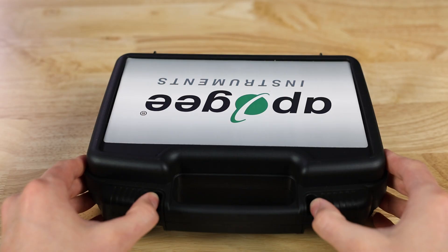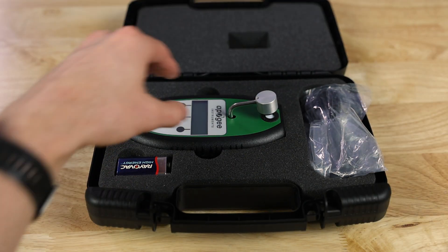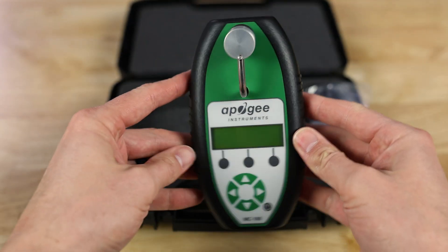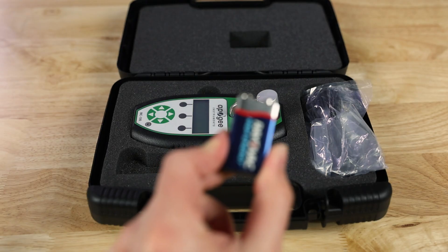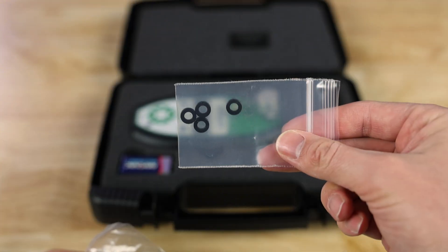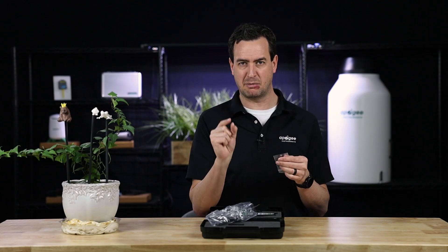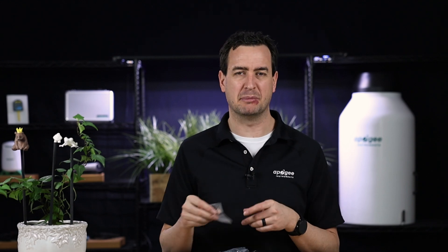Let's take a brand new meter and I'll show you what's inside the box. As we open it, we have the chlorophyll concentration meter, a nine-volt battery, a USB cable, and some sensor area reducers. These sensor reducers come in really handy if you're trying to measure a leaf that's really small — we'll talk more about that in just a little bit.